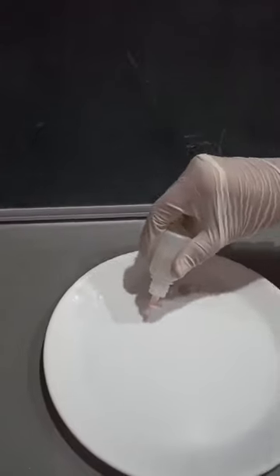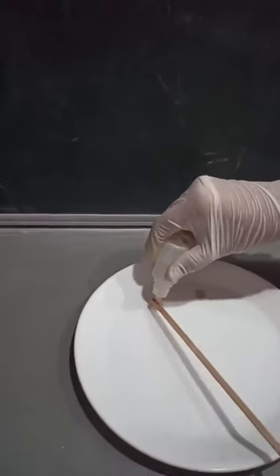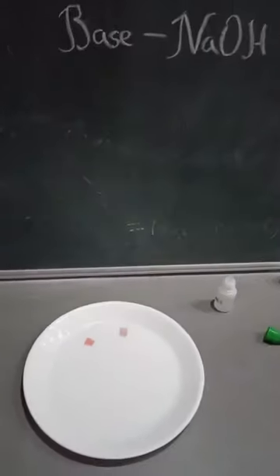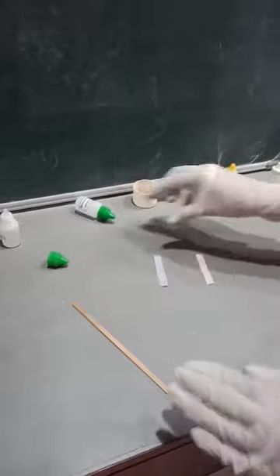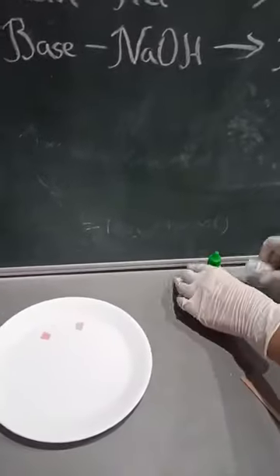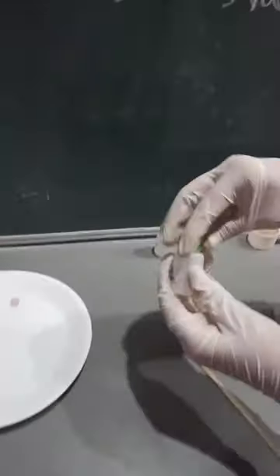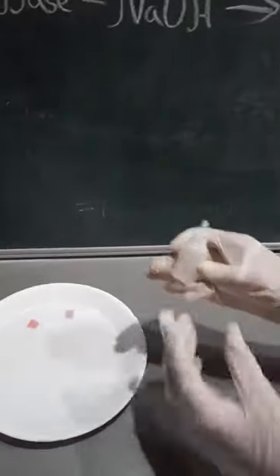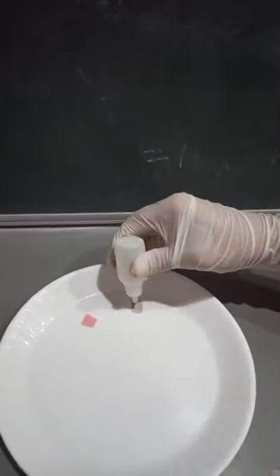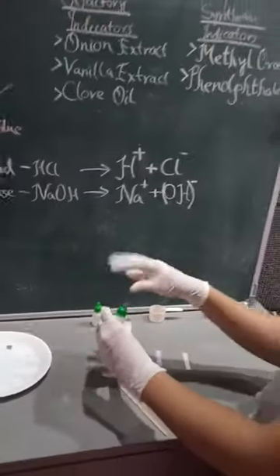Yes, the colors have changed. As you can see, it turns a very bright red color. But previously, as you may know, it was this type of blue color. And right now, let's see if it changes the same with the red litmus paper. So this is the base I am using again. Wow, look at it. It turns into a very deep blue because it is a base.